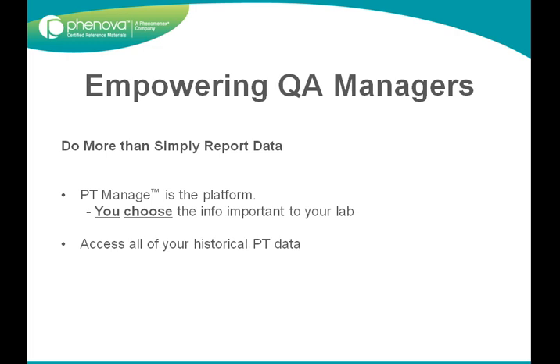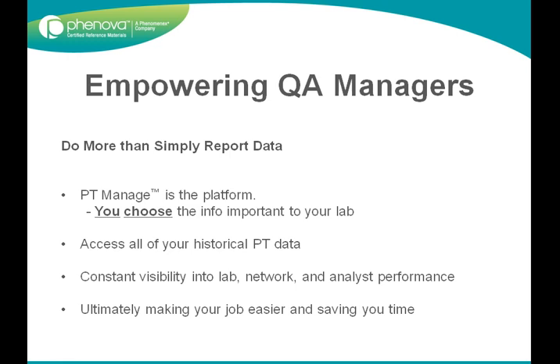You can access all of your historical PT data that's been submitted to Phenova and have constant visibility into lab, network, and analyst performance, ultimately making your job easier and saving you time. So let's take a look at this tool called Custom Report Generator within PT Manage.